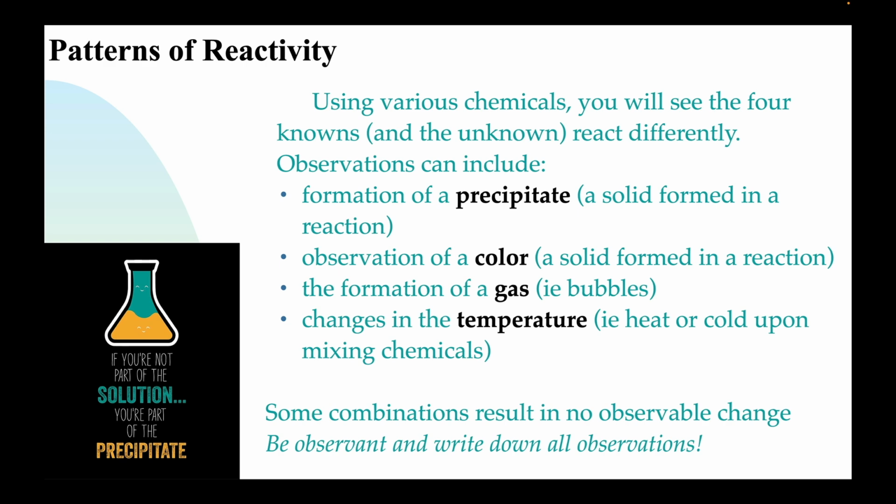You also want to see if there's a gas formed, bubbles, like fizzing, stuff like that. That represents some kind of chemical reaction. And you might be able to identify changes to the temperature. Probably things would get warmer, but you could also feel things get colder. Now, this is tough to do, and don't lose any sleep if you don't see any changes of temperature, but it is another way to identify some kind of pattern of reactivity.